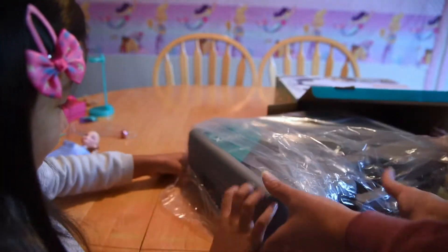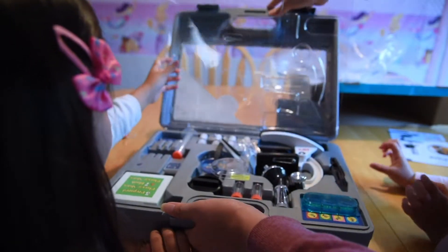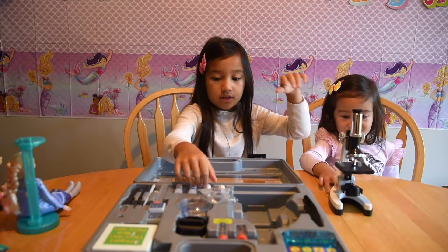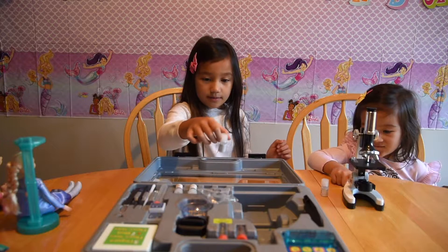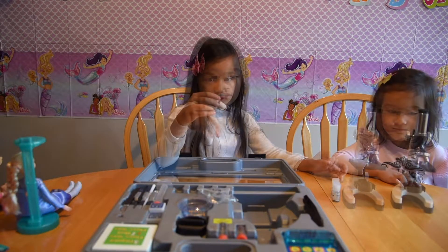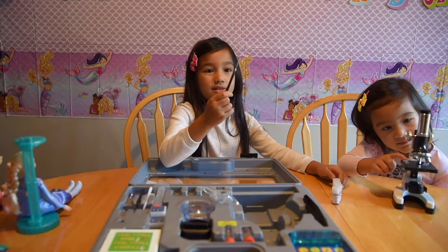It's so big! Sharp objects inside! This set comes with a microscope of course! It comes with sea salt, gum media, and brine shrimp eggs. It's powerful!